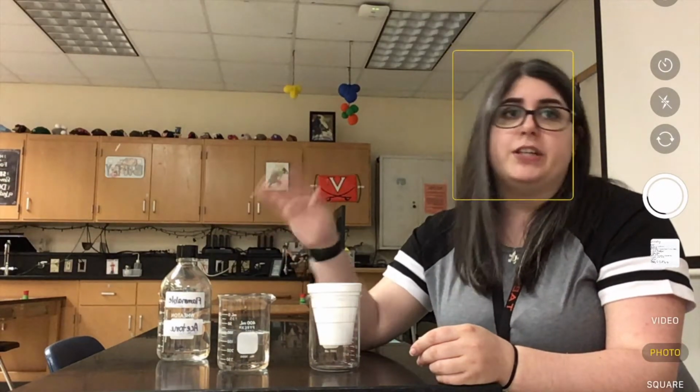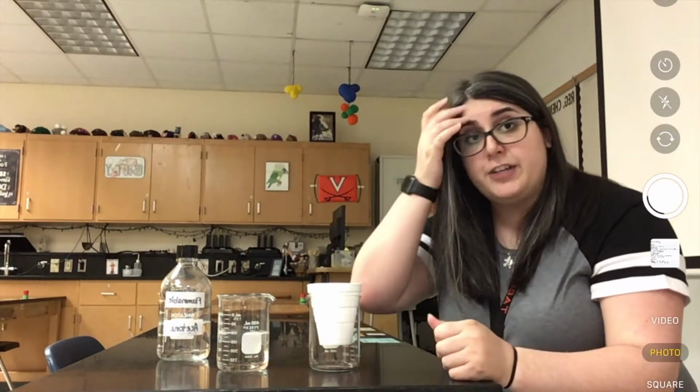We're going to be looking at three different substances. We have water, which is a very common polar substance. We've looked at the structure of water before with its oxygen and hydrogen bonds, and the unequal distribution of electrons between that oxygen and hydrogen. Then we have styrofoam and acetone, whose structure we're not going to talk about, but we're going to look at how these interact with water or with each other to determine their polarity.